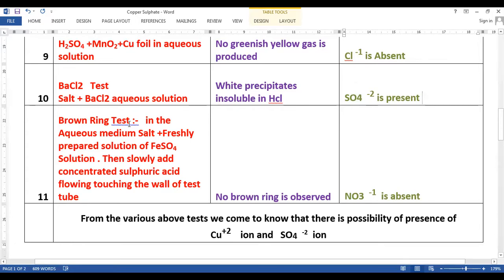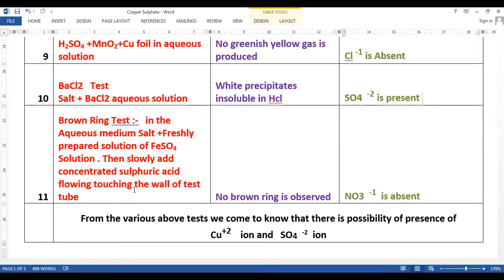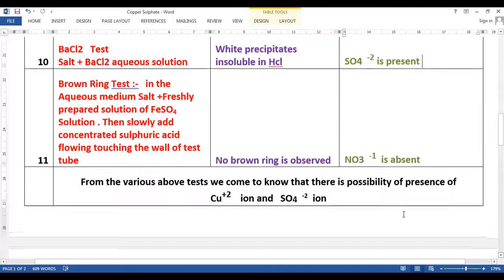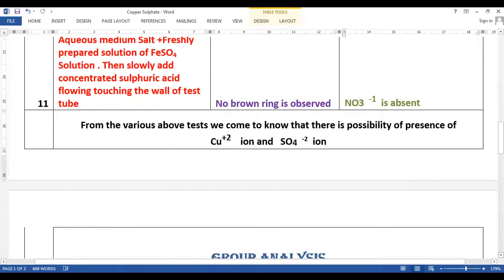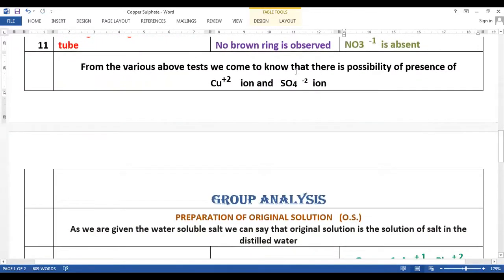The next test is the brown ring test. In an aqueous medium we take the salt, add freshly prepared FeSO₄ solution, and then slowly add concentrated sulfuric acid, allowing it to flow down the wall of the test tube. At the juncture of the two solutions we do not get any brown coloured ring, and as we do not get the brown ring we consider NO₃⁻ ion is absent.